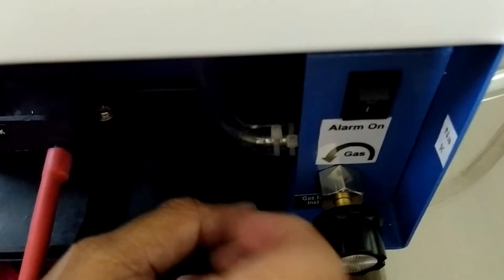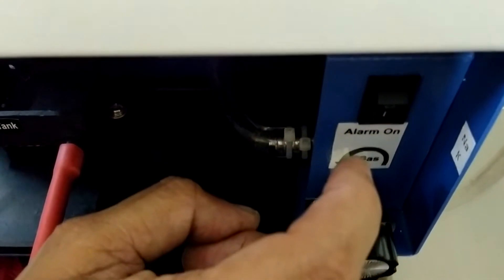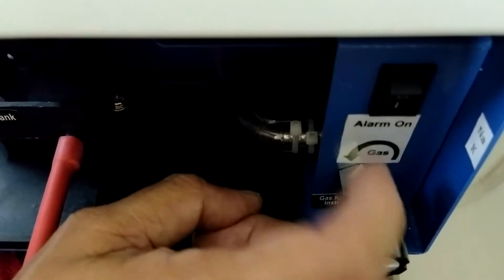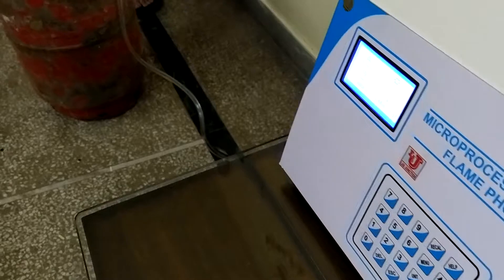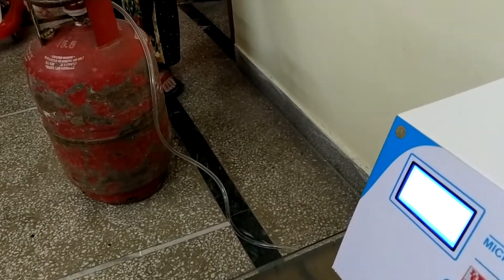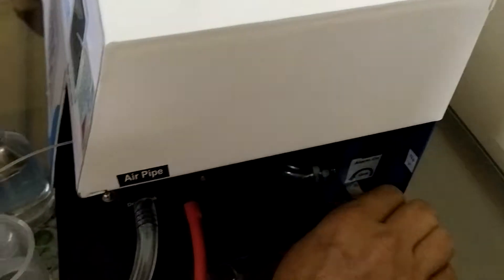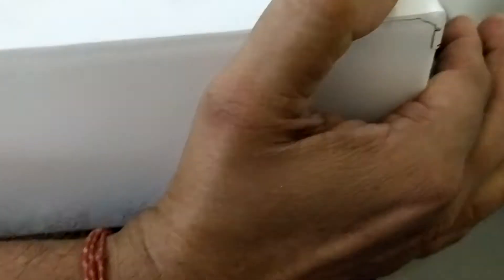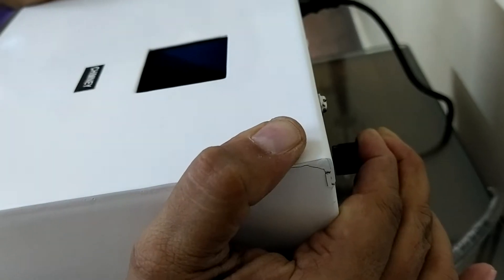If gas is not present, the alarm indicates a beep. You can take advantage of this by switching on this alarm. Now switch on the gas cylinder supply.